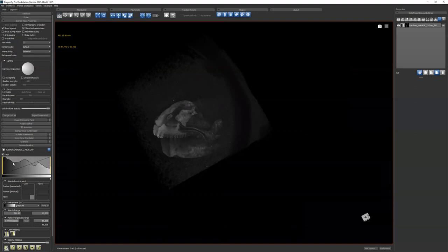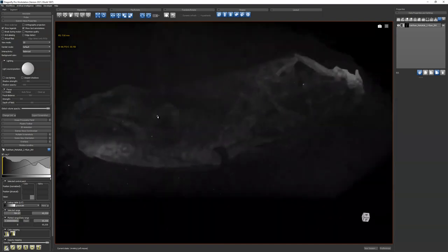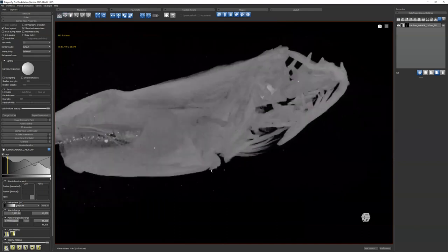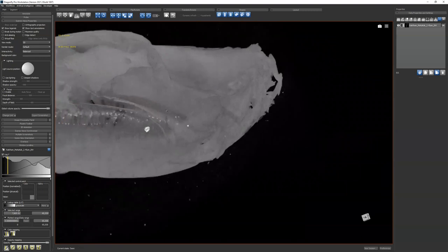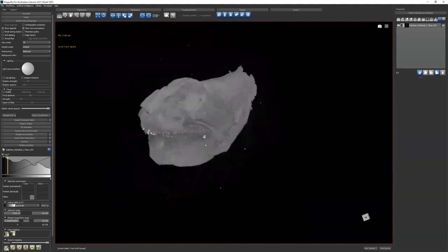And what usually causes that is something like this particle will cause the auto reconstruction to fail, but that's another topic. So we're just doing Dragonfly.